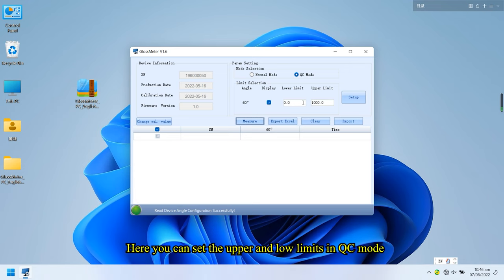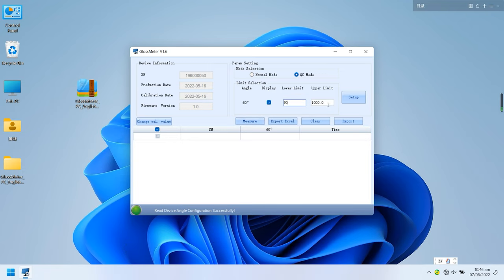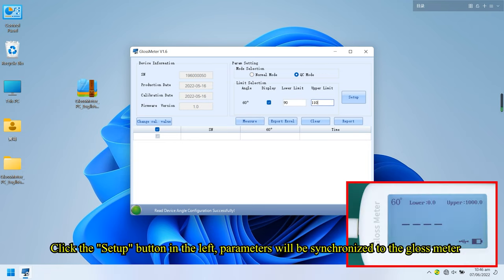Here you can set the upper and low limits in QC mode. Click the setup button in the left, parameters will be synchronized to the gloss meter.